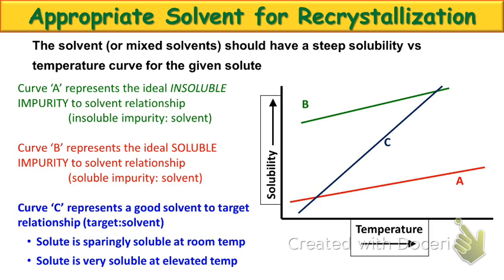This is a very popular curve that shows up on pretty much every single exam, handout, post-lab assignment I've ever seen. Okay? So it's really, really important to be able to interpret this. As you should do with any curve or any kind of graph, we should go through and simplify it as best we can before we attempt to interpret it. So what can you tell me about that point? That little red dot.